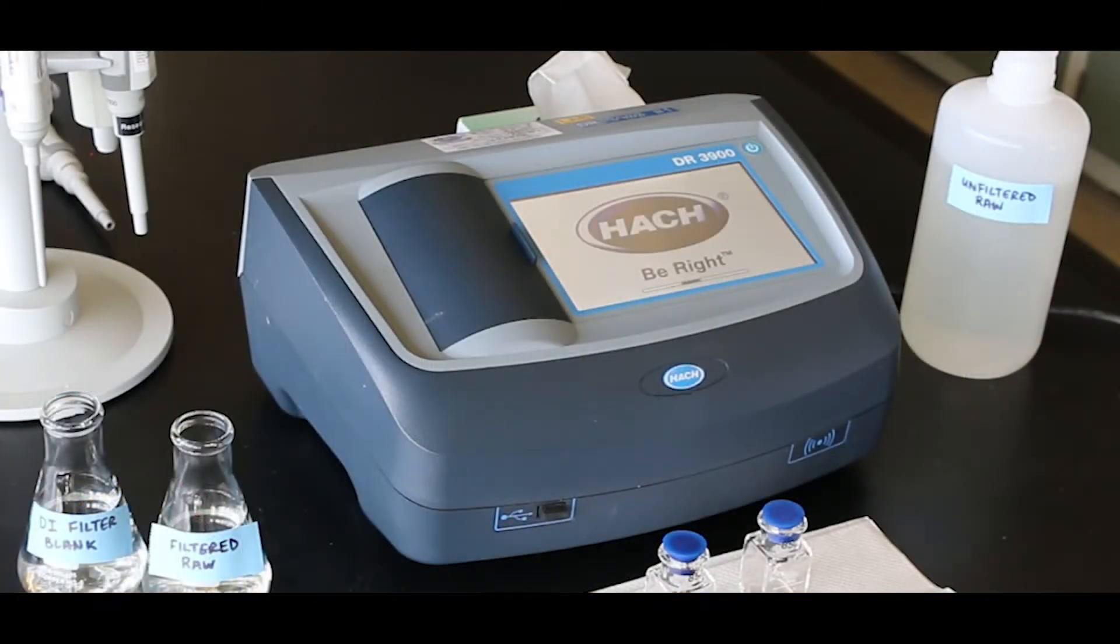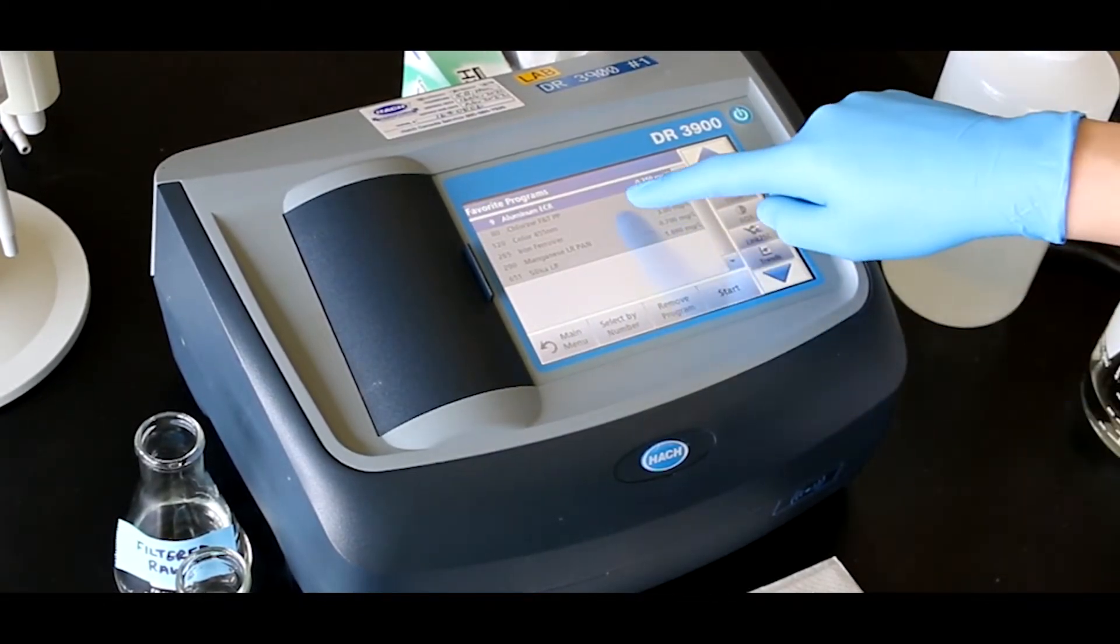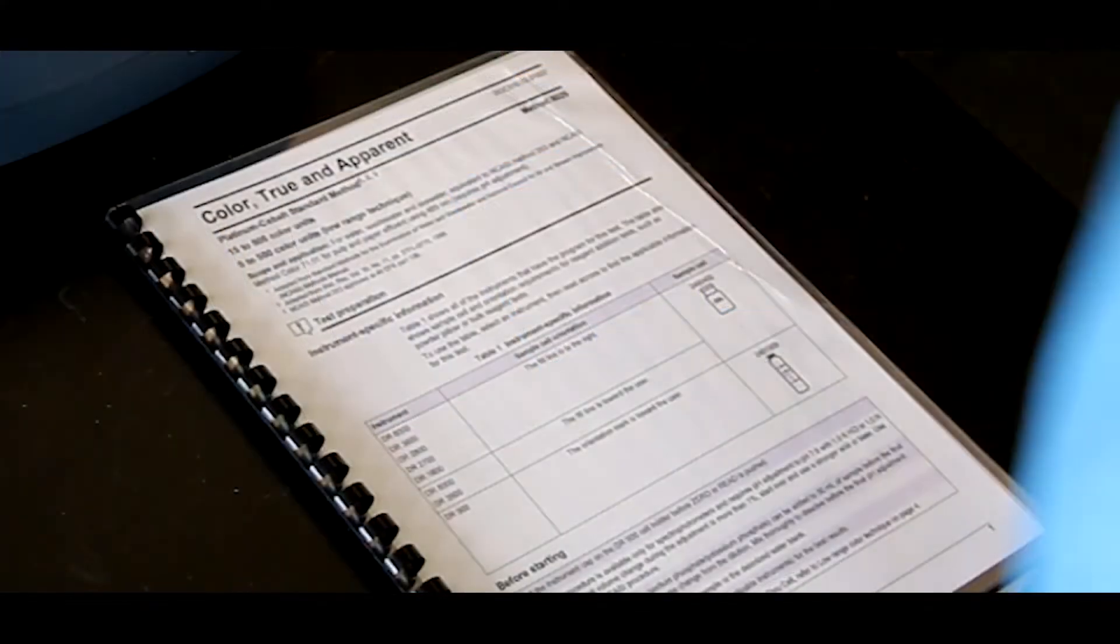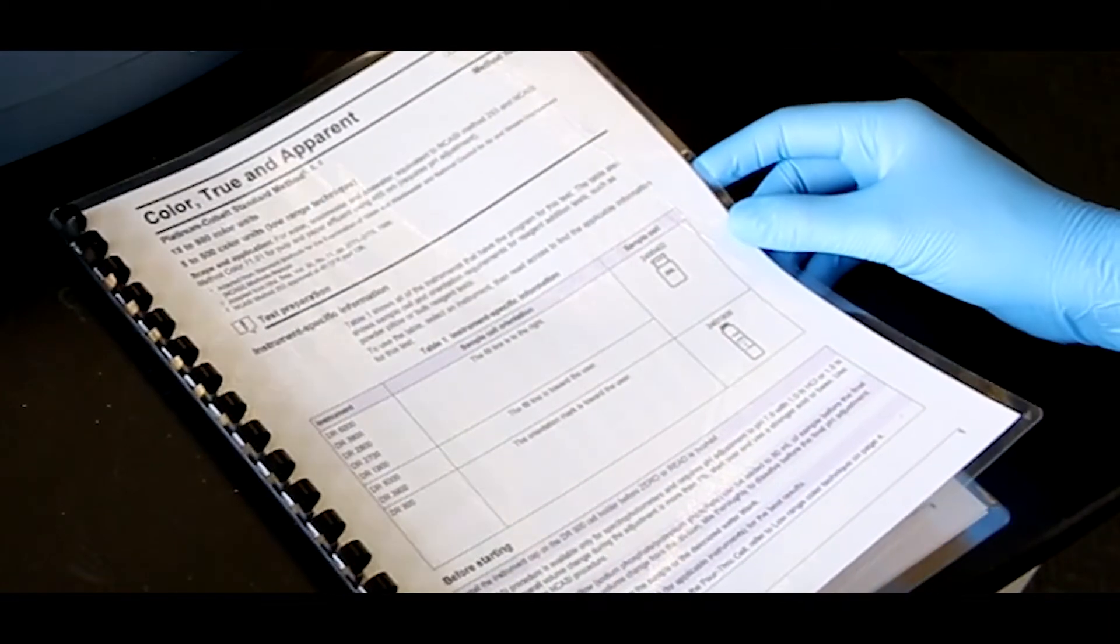We will be using a HACH DR3900 spectrophotometer for our demonstration. Start the instrument and select the appropriate program. Information on sample cells, adapters, and light shields can be found in the method.